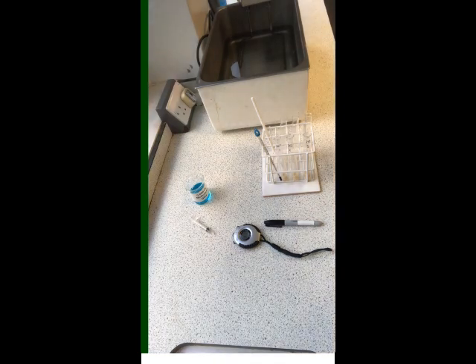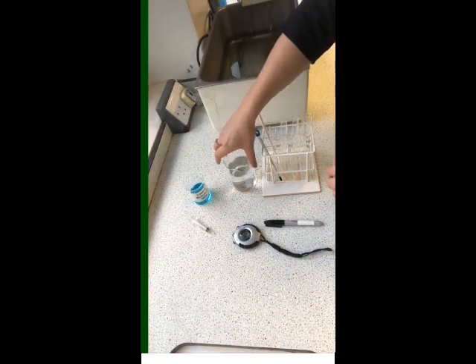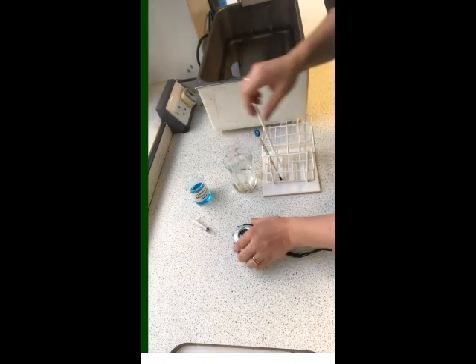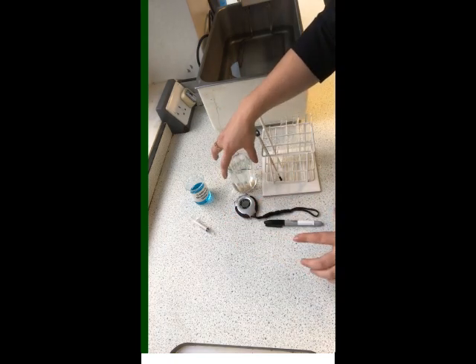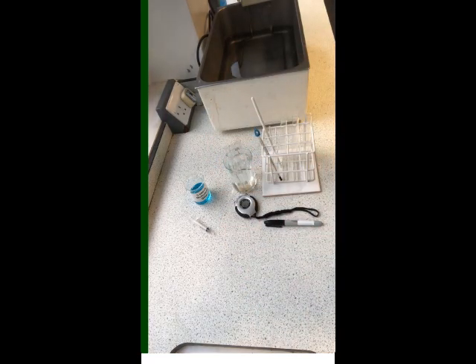So next thing we are going to do is place these tubes into their own water bath. Now we're using room temperature, so we can simply fill a beaker with some room temperature water. Okay, and then we can place the mixture into this. This is to leave it for, so I'll stop my timer, we're going to leave it for 5 minutes, so that this gets up to the correct temperature before we start the experiment. Okay, so we will now wait for 5 minutes.